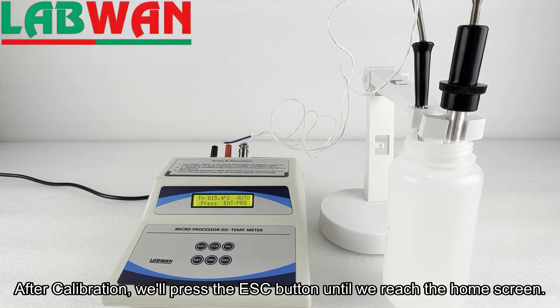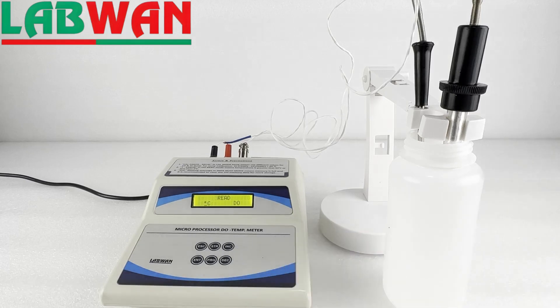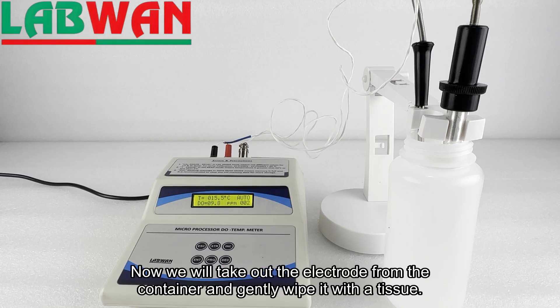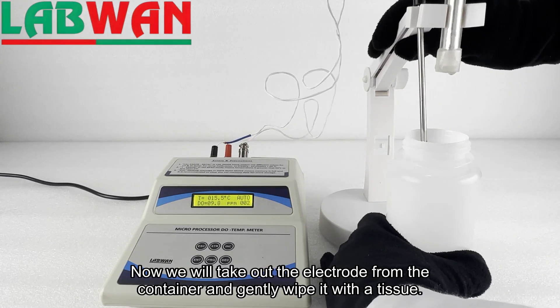After calibration, we will press the escape button until we reach the home screen. Now we will take out the electrode from the container and gently wipe it with a tissue.